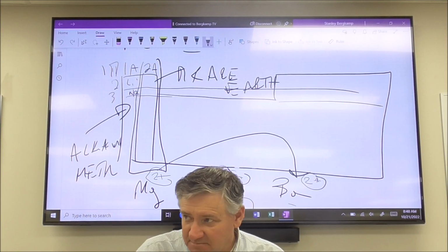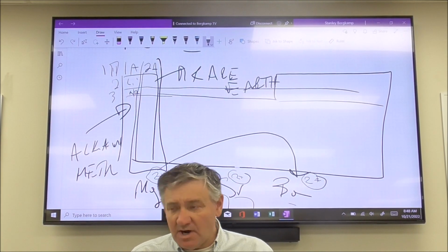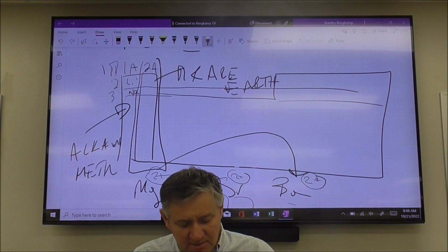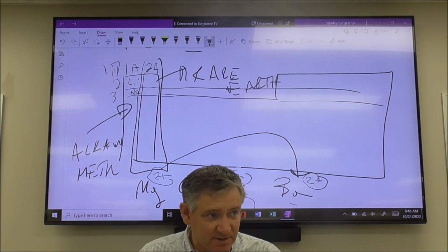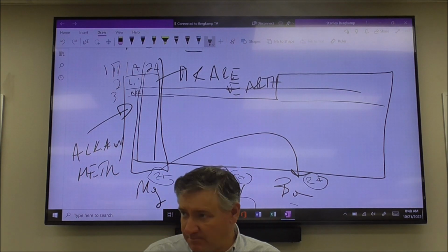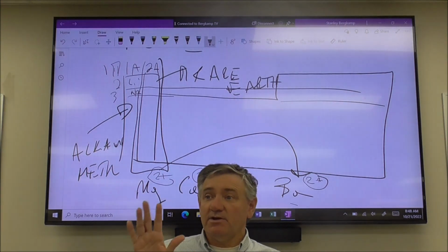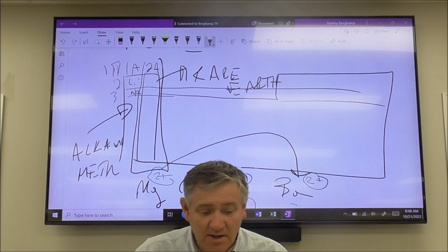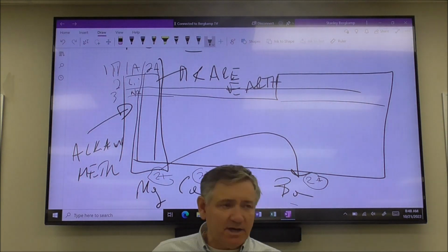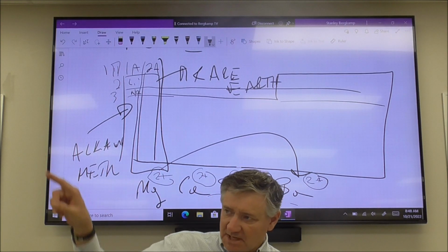And again, listen to me. Your unknowns are not the reagents. Your unknowns are not sodium carbonate, sodium sulfate, or potassium iodate. That isn't your choice. Your choices are either magnesium, calcium, strontium, or barium. So here's what I'm looking for on that. Let's say, for example, you think I gave you calcium. Okay, cool. So you'd say calcium.